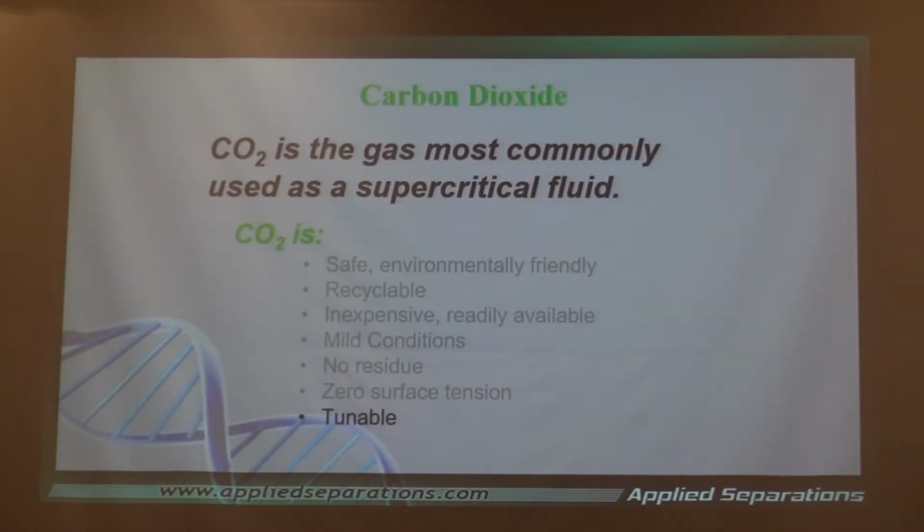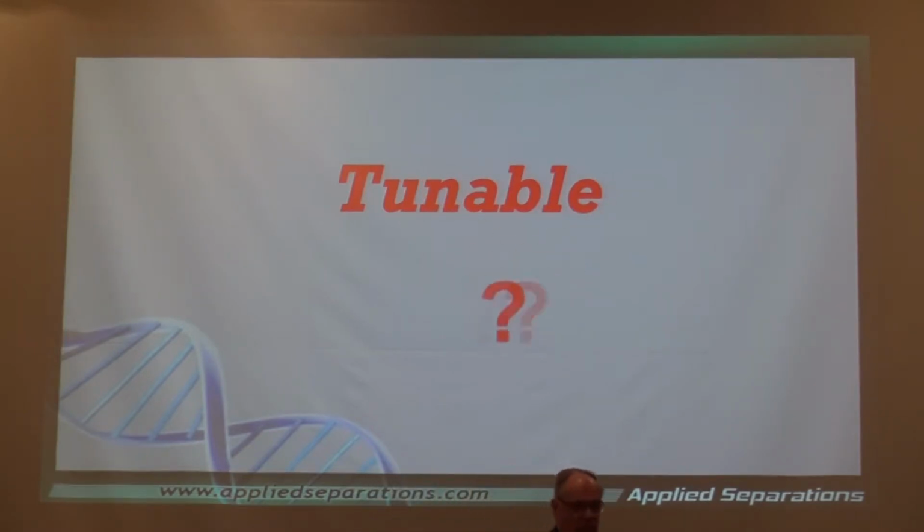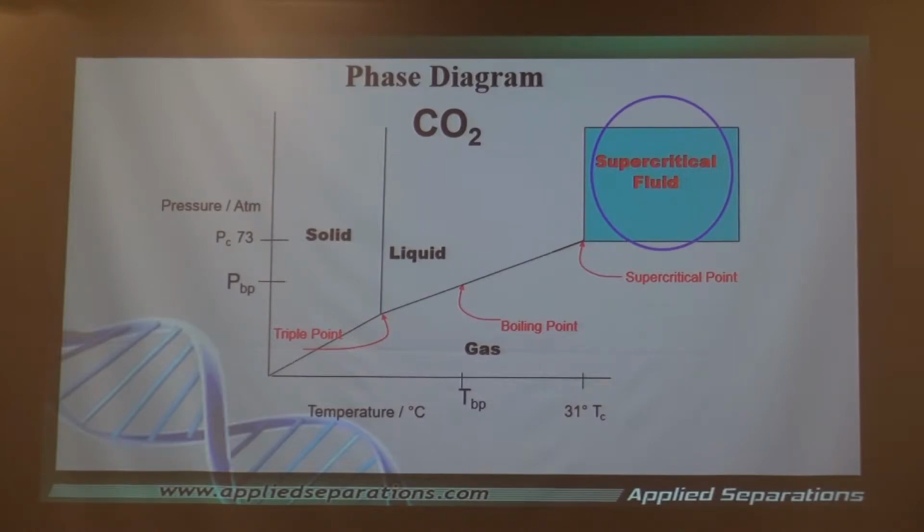Tunable. And this is probably one of the most important considerations, especially in doing natural products extractions. We'll talk about tunable. Tunable, what does that mean? When we talk about tunable, very simply, we can talk about a TV set, where we have one TV set, but we could go ahead and change the channels, and we have a variety of different programs. We tune the TV, tune the channels. But we can do the same thing with a supercritical fluid.